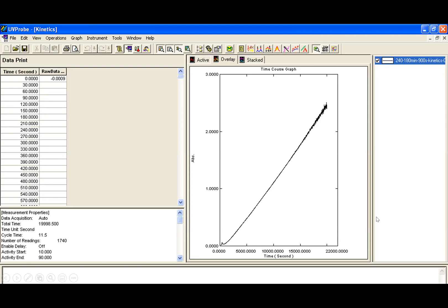To get the raw data you just save the file. You can save a text file after you get your data. To access this data print, you also have to click on the Data Print Table up here on this button on the toolbar and that's it.